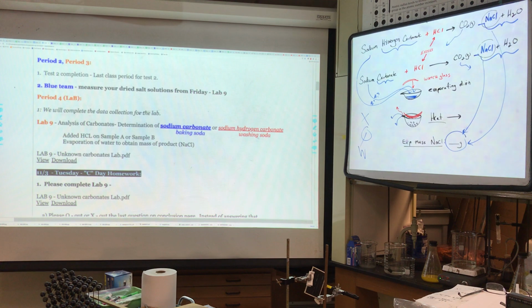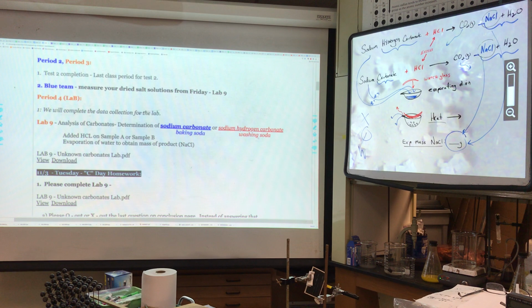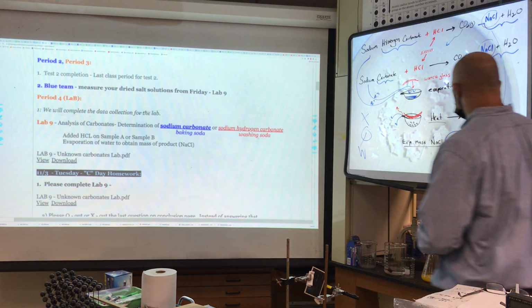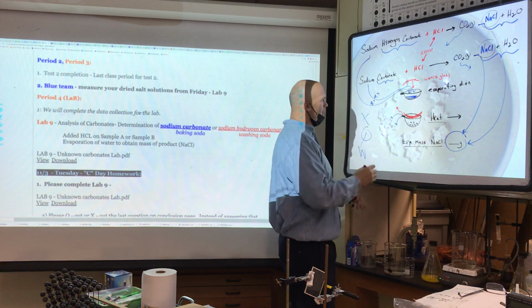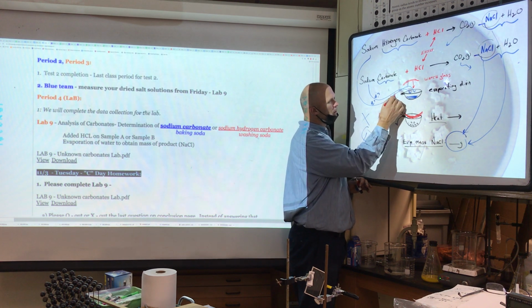Maybe, maybe not. And let's focus. That didn't do anything. Got it. Oh, it's too close. All right, so these are some beautiful crystals. All right, I don't know if you can see from the screen, but these are very cubic. All right, these are pretty cool crystals.